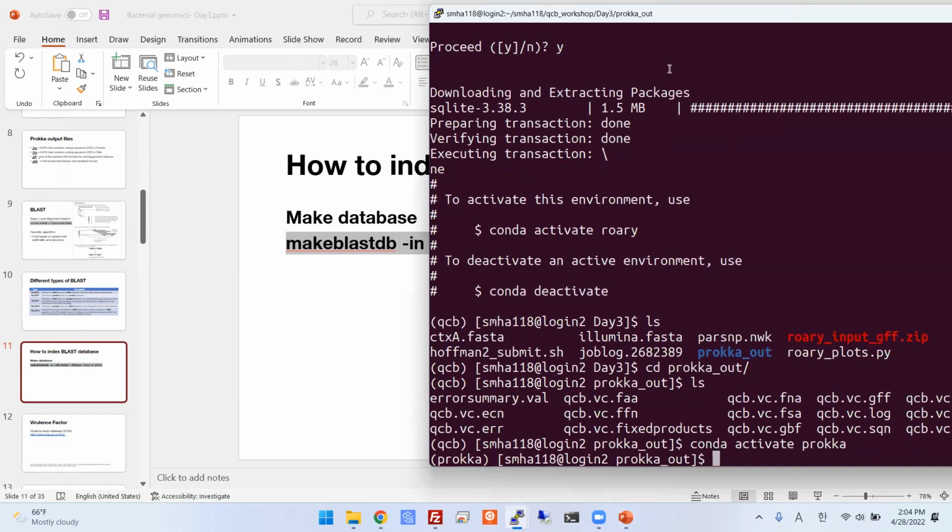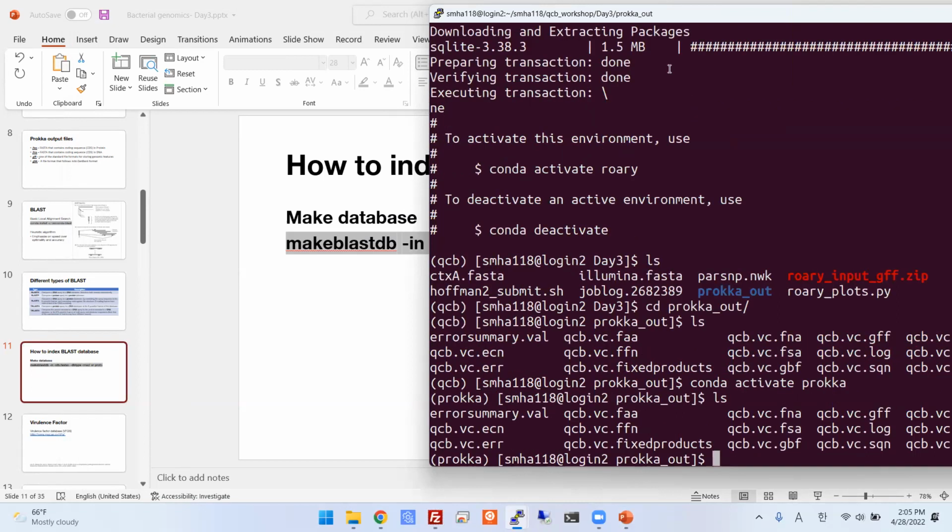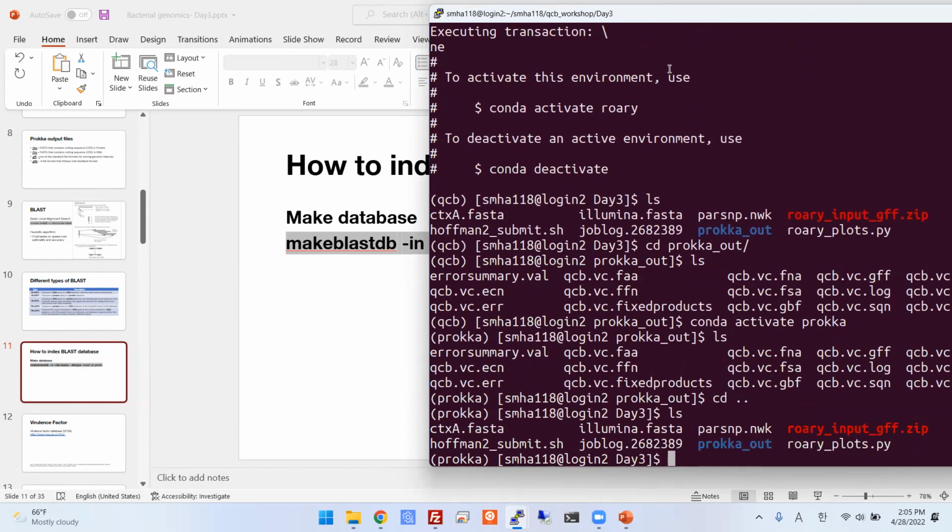So should we have, when the Prokka command is done, seen a new directory called prokka out? I don't see that. I think that there was something wrong with my script. Okay. Maybe you can share your screen. Can I see your script? Sure.